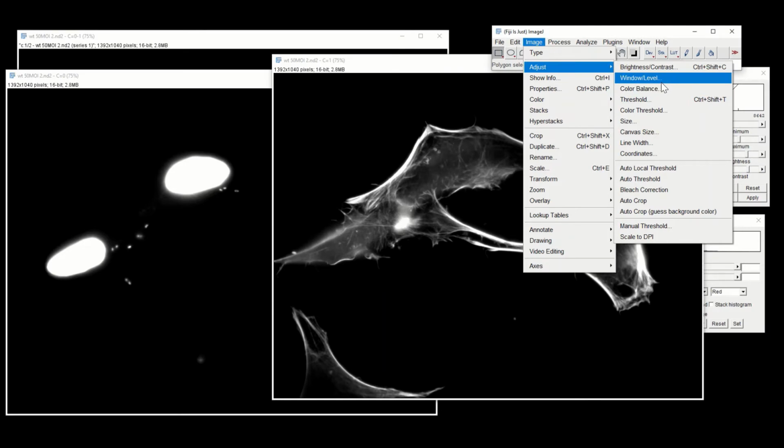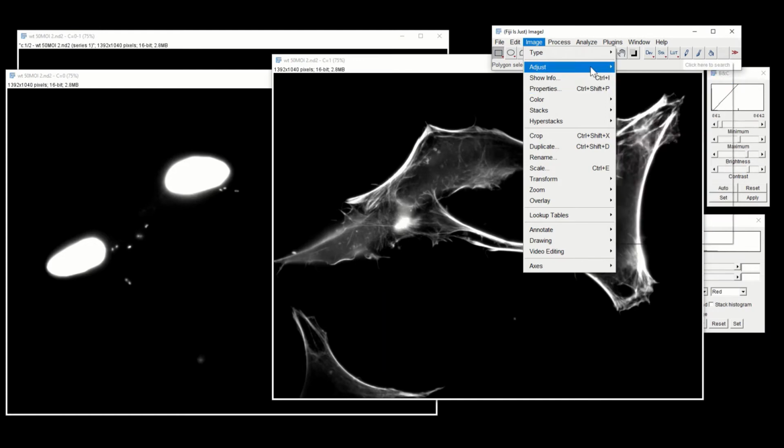unless of course you're colorblind, and then you would use CMYK altogether to show the differences between the two channels. So again, I highly encourage you to have a look at that feature as well, instead of RGB, presenting everything in CMYK.